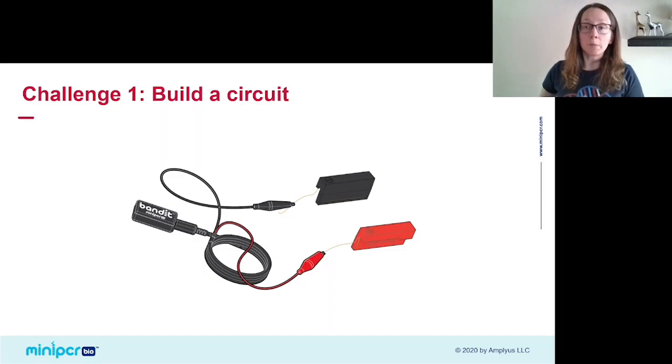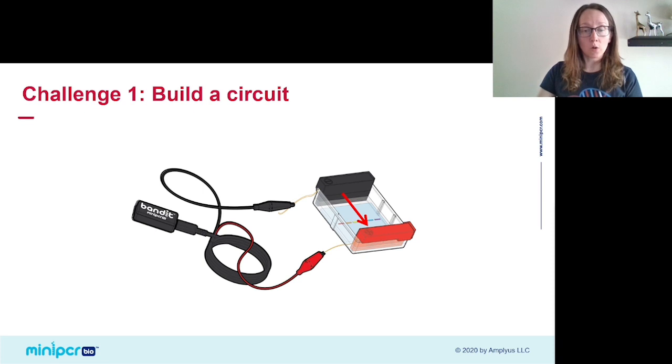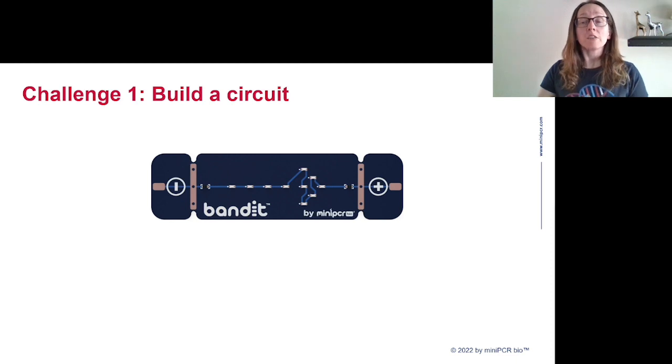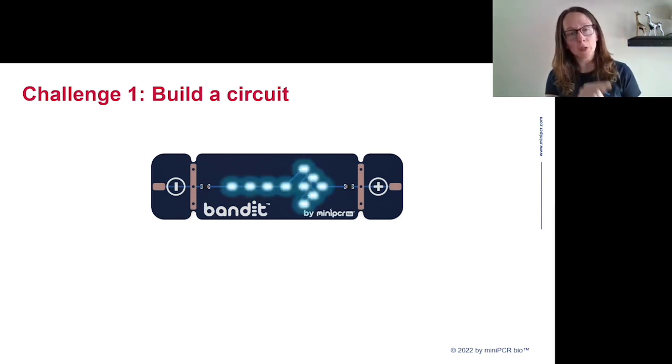Ultimately, we'll be completing this circuit by putting a gel and some buffer between those electrodes. But before we do that, we need to figure out the direction through which the current will flow between these leads. Is it going to flow from the black electrode into the red one, or from the red electrode into the black? This is going to be important to figure out because later on, we'll use that knowledge to make sure DNA is flowing through our gel in the direction we need it to. We give you a little testing device you can use to figure out the direction of current flow. This is a little circuit board with LEDs that will only illuminate when electricity is flowing from the negative contact on the left there to the positive contact on the right.